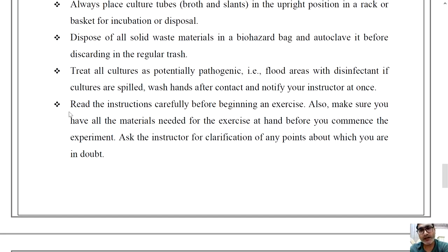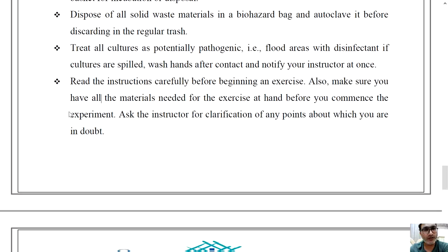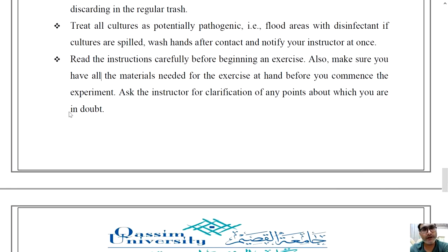Flood areas with disinfectant if cultures are spilled. Wash your hands after contact and notify your instructor at once.